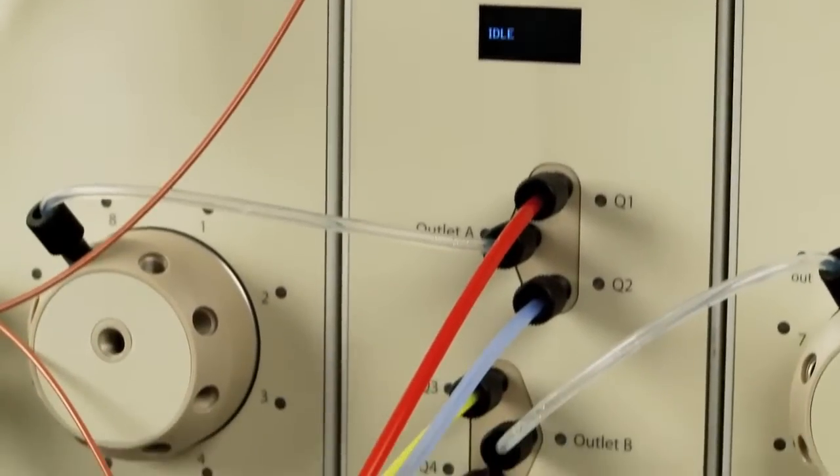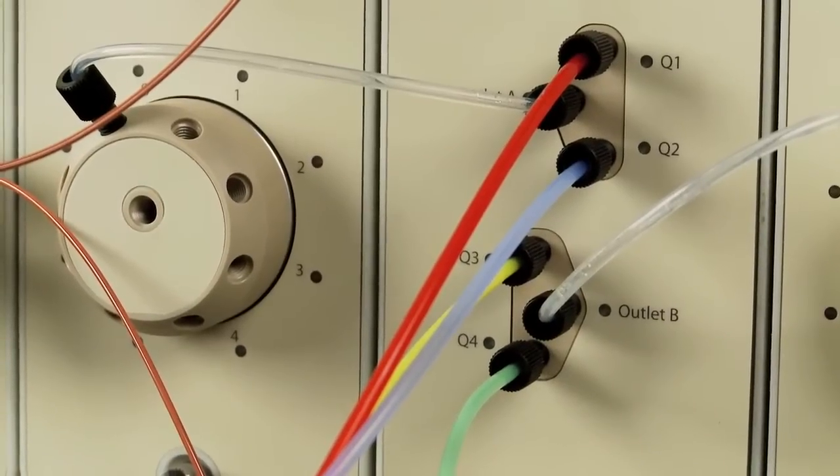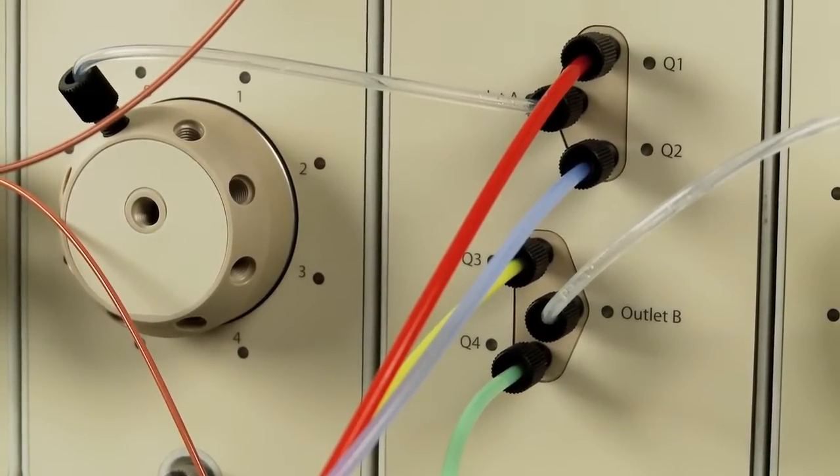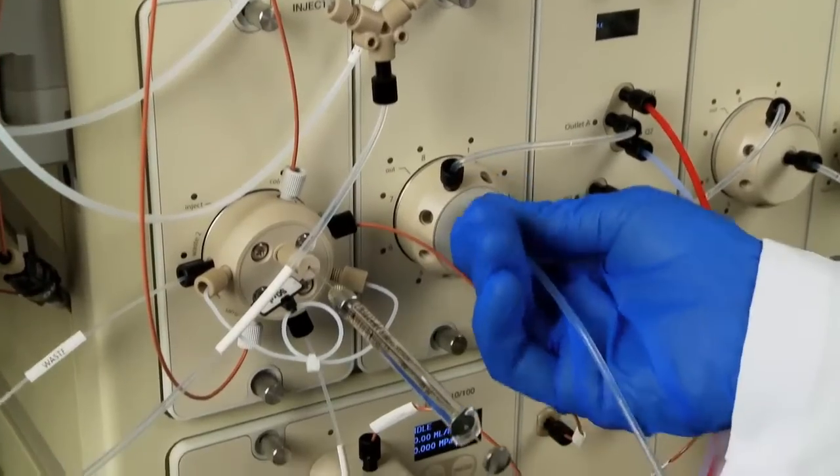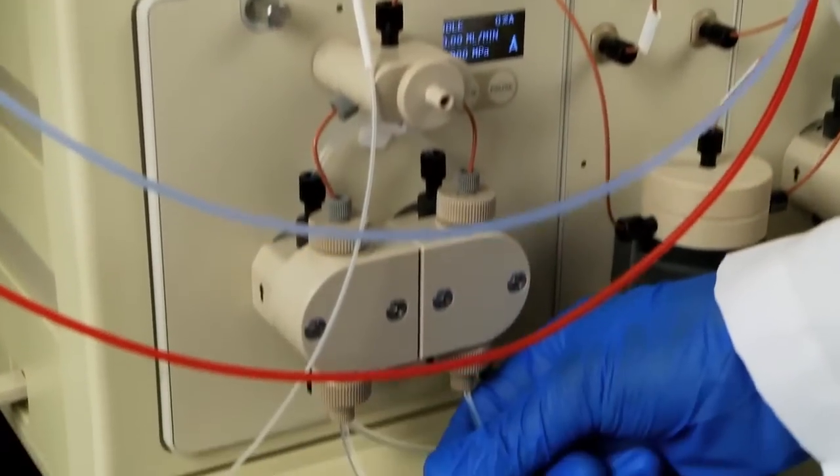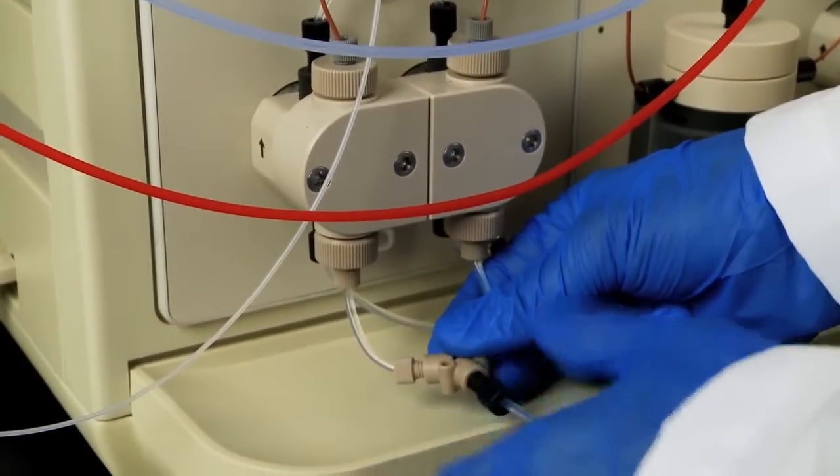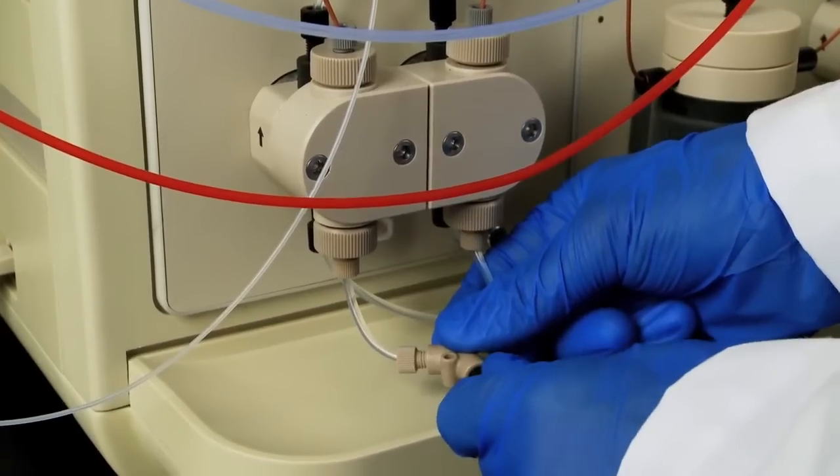The buffer inlet lines are color coded based on the solution that they represent. Refer to the NGC installation guide for more details. Attach line number 6 to the outlet port of buffer inlet valve A, and then attach the other end to the inlet manifold for pump A.